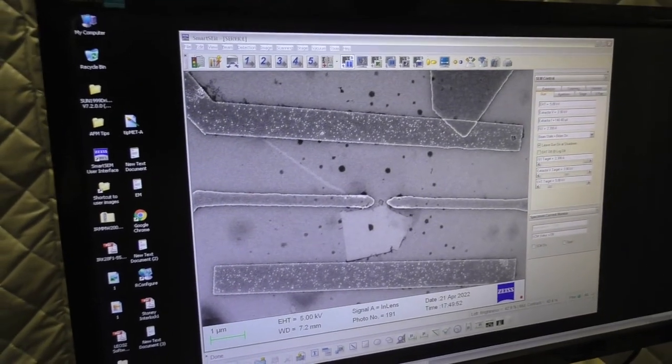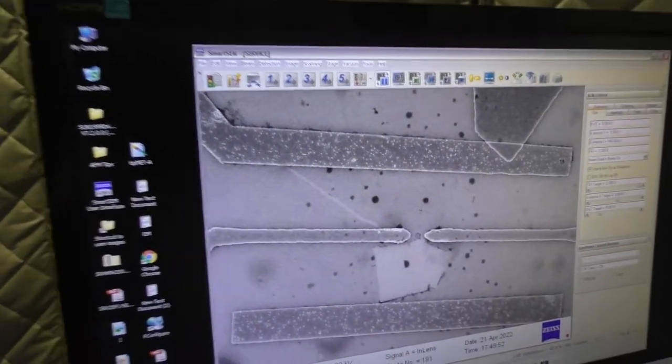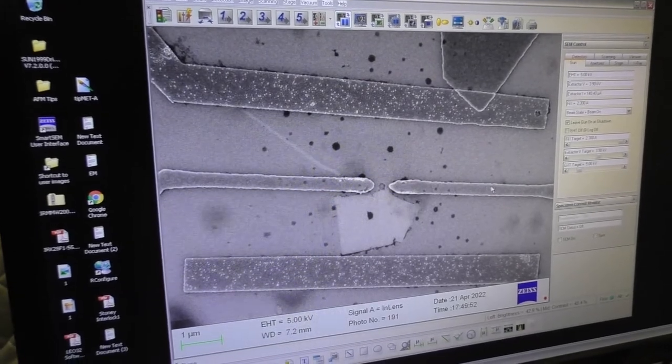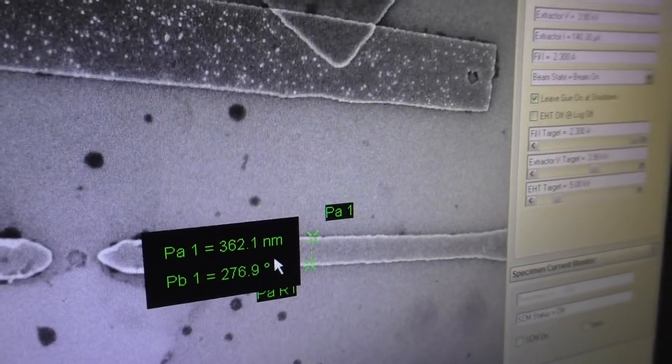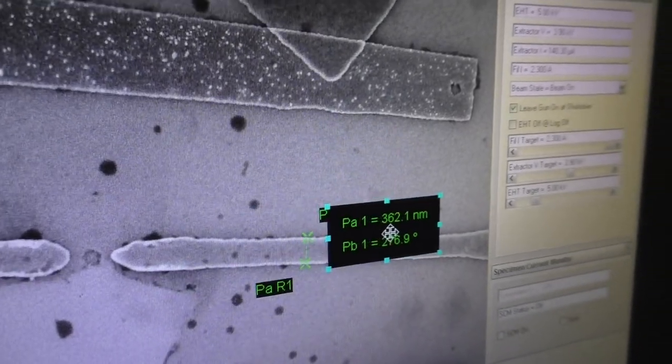The response of the detector assigns brightness at each point which constructs the image. A slow scan like this allows the signal to average, which creates a smoother and less noisy image.